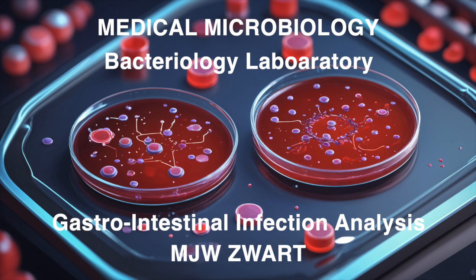Question 3. What's the role of selenite broth when we're culturing for Salmonella and Shigella? Oh, selenite broth. It helps those Salmonella and Shigella grow, but it keeps other bacteria from taking over. Exactly. It helps isolate the pathogens we're looking for. Now, for a visual challenge, can you describe what Yersinia enterocolitica colonies look like on CIN agar? I remember this one. Yersinia enterocolitica often has that bullseye look on CIN agar. You know, red center, clear halo, like a little target. Perfect description. You've got a good eye for detail.